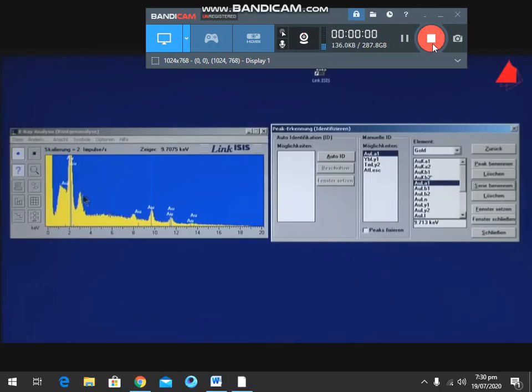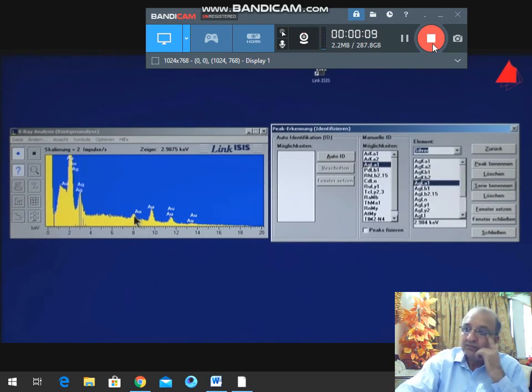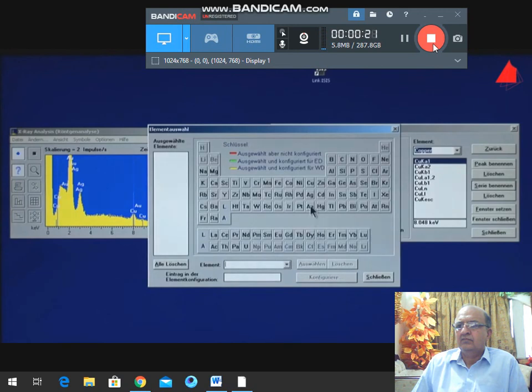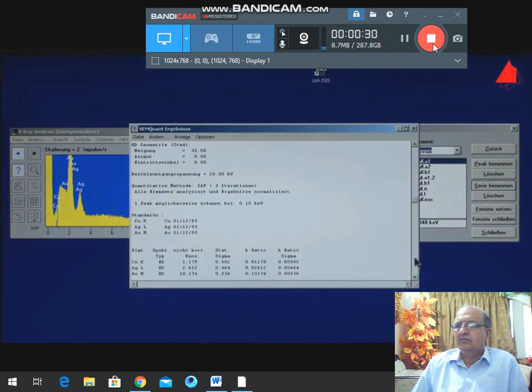The spectrum of the piece of jewelry builds up. Chemical analysis is then carried out using sophisticated methods with the help of a computer. Certain limitations must indeed be minded, but it's definitely a fine method, and above all, it is completely non-destructive, and even very small spots on a sample can be analyzed. And what has happened to the small cobalt plate, which was one of the samples? It was used to calibrate the measurement. This means to adjust it finely.